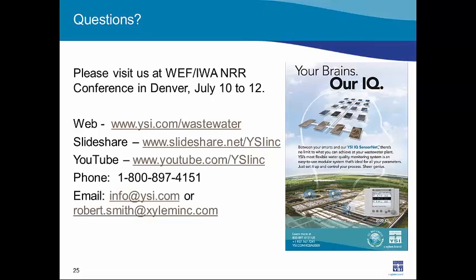The only thing that might go is the lamp, and what I was told is the lamp lifetime is just absurd. It's way beyond what you're probably going to need. In fact, you're probably going to upgrade your technology before the lamp goes. And then the other part of the question, I think we talked about how the unit is calibrated. So, yeah, that's some ballpark numbers on costs and lifetime.